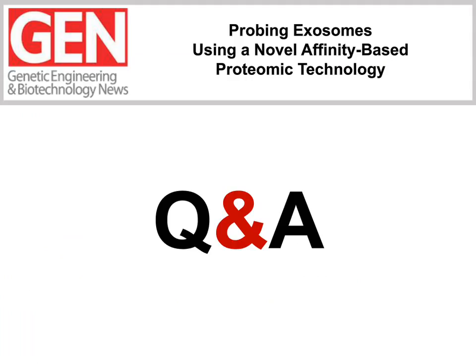Okay, thanks. So the short answer is that the reagents are detecting the availability of a 3D shape and charge epitope. And anything that changes that shape or charge will change the binding characteristics of the reagent. Our collaborators at King's, for example, have done a lot of work on looking at protein quantitative trait loci, the association of SNPs with apparent changes in protein concentration in healthy people. And they've shown that they've detected so far about 100 of the proteins on the menu which are associated with SNPs. And the most likely explanation for the apparent differences in concentration is not that the overall abundance of the protein has changed, but that the binding site has modified in the presence of a SNP.